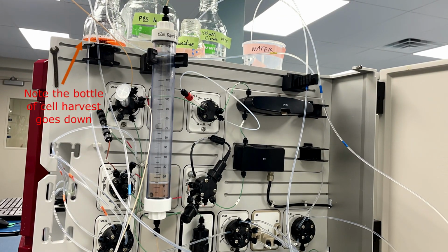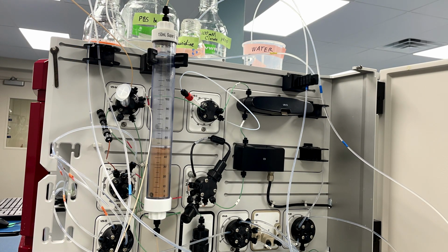I can't tell you how many times it took me to get this shot. I'm running at 10x speed, and you'll notice that this stopper for the super loop goes up as the bottle of cell harvest on the top of the Avant goes down.